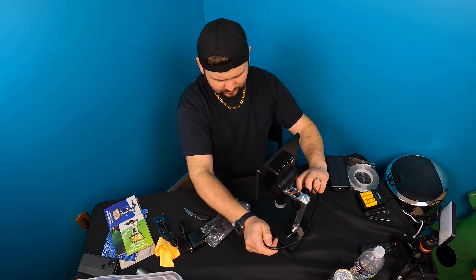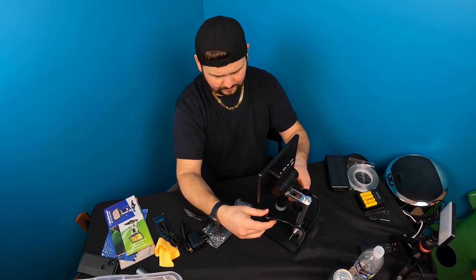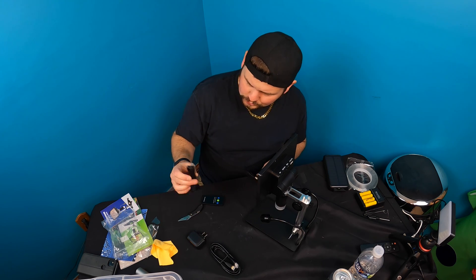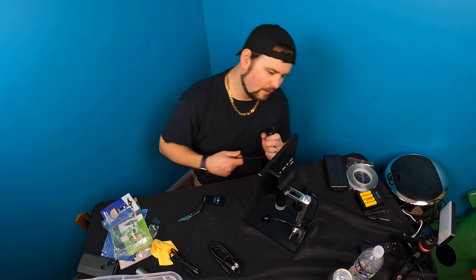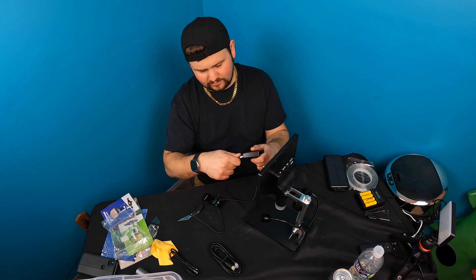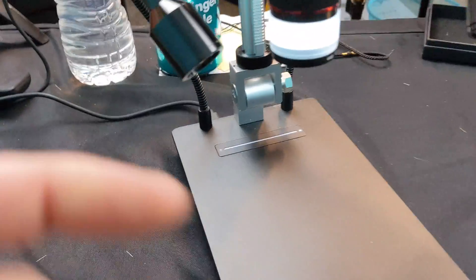You can connect this to something else using the cable — they give you an HDMI to mini-HDMI cable. They also give you two USB to Type-C cables, which you can use for connecting to your computer if you don't want to take the SD card out. The power supply is simply a USB that plugs in here, and then you plug the Type-C into the back.